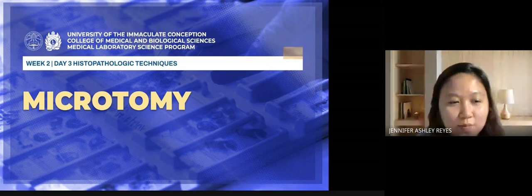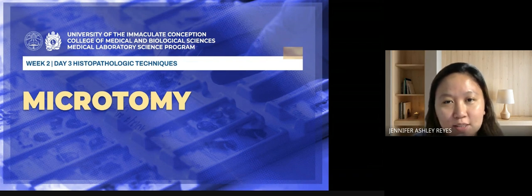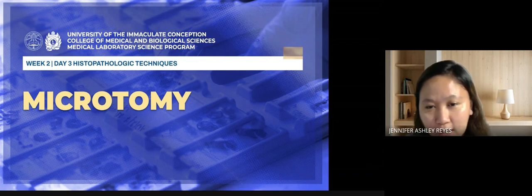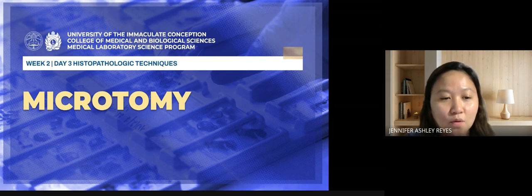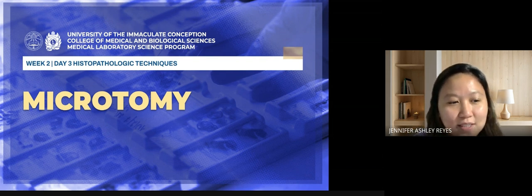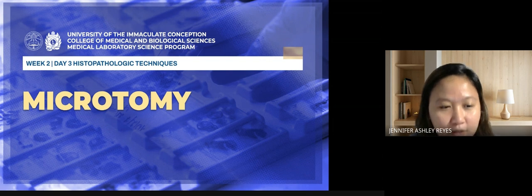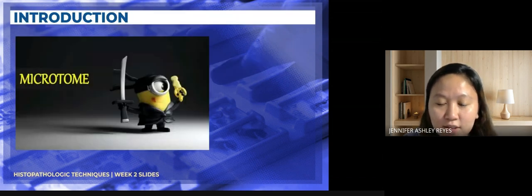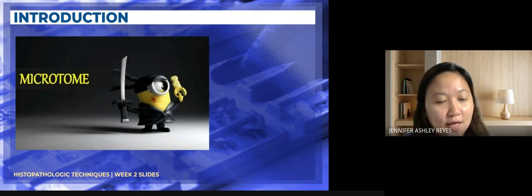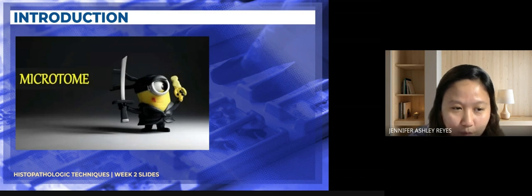So this is one of the culminating activities or procedures for your histopathologic technique. From tissue processing, after you're able to fix your tissues and then up to the point that you're able to embed them, you are now ready for the fundamental technique that allows you to cut tissues thin, which is important for histologic examination, histopathologic examination under the microscope.